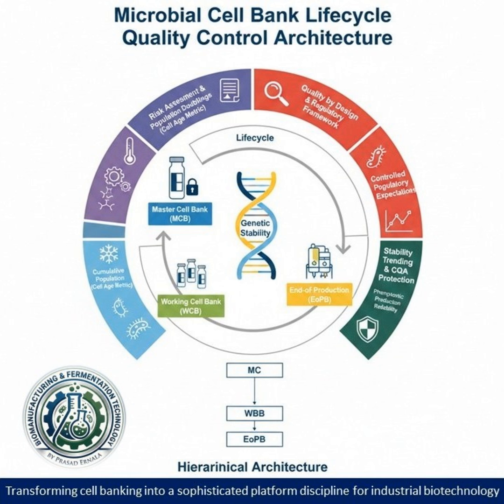You mentioned that just counting the live cells, the viable count, is a weak predictor of success. If viability isn't enough, what else has to be on the release test? You must include post-thaw functionality. That has to be a CQA. So not just did it survive, but how well is it working? Exactly. You need metrics that predict how the seed train will perform. For instance, recovery kinetics. How long does it take to reach a target cell density?